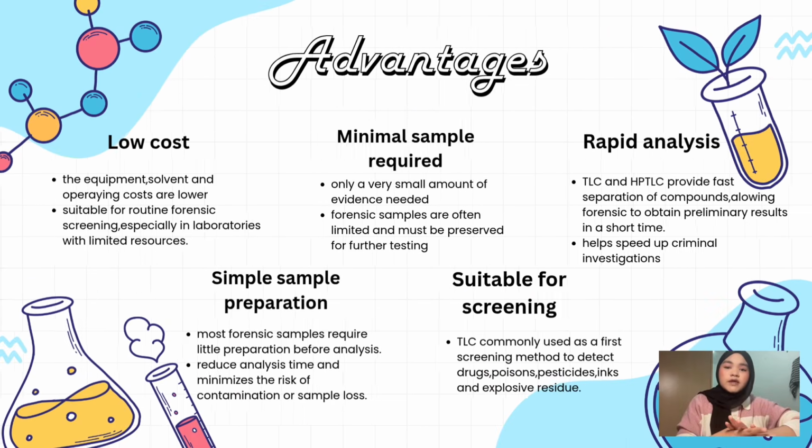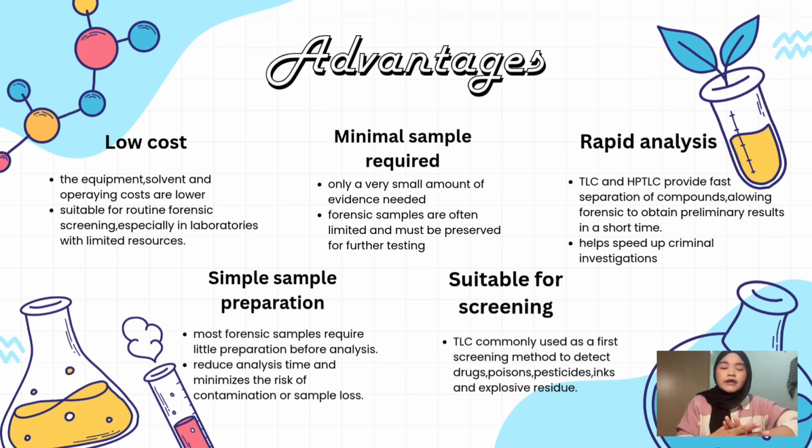I will explain the advantages of using thin layer chromatography, or TLC, in forensic analysis. The first advantage is low cost. Compared to other chromatography techniques, TLC requires less expensive equipment, solvent, and operating costs. Because of this, it is suitable for routine forensic screening, especially in laboratories with limited budget or resources.